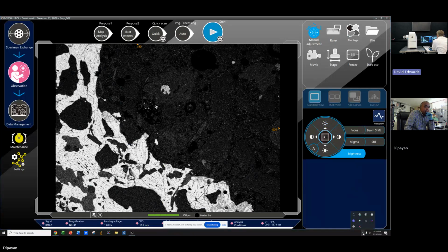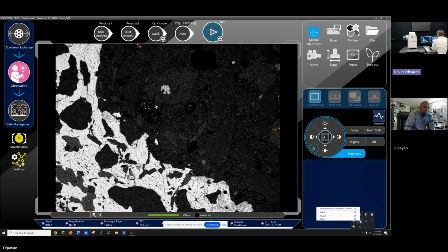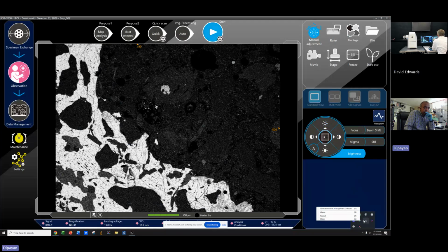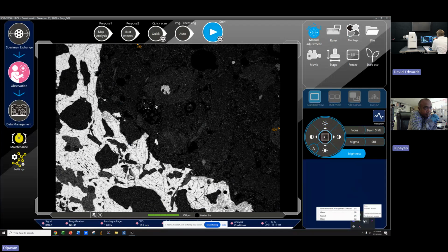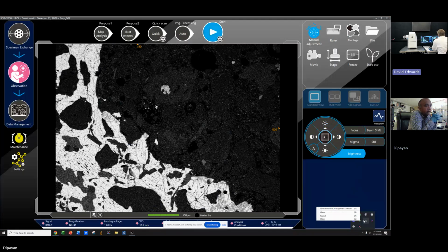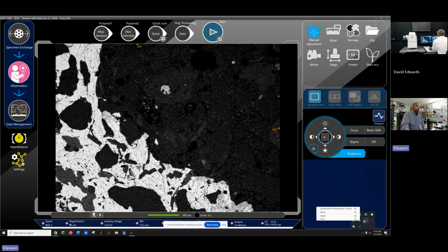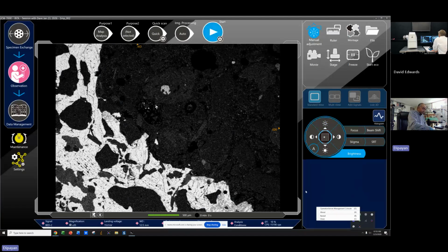Press that, and then there's a green circle. Right click where it says restart. Don't do it now. But when the EDS is not coming up, try clicking restart. It will close your SEM window, but what it's going to do is restart the operation server for the SEM. That may solve the problem. Otherwise we need to look a little deeper. So basically, you're telling me to restart the operation server. Okay.